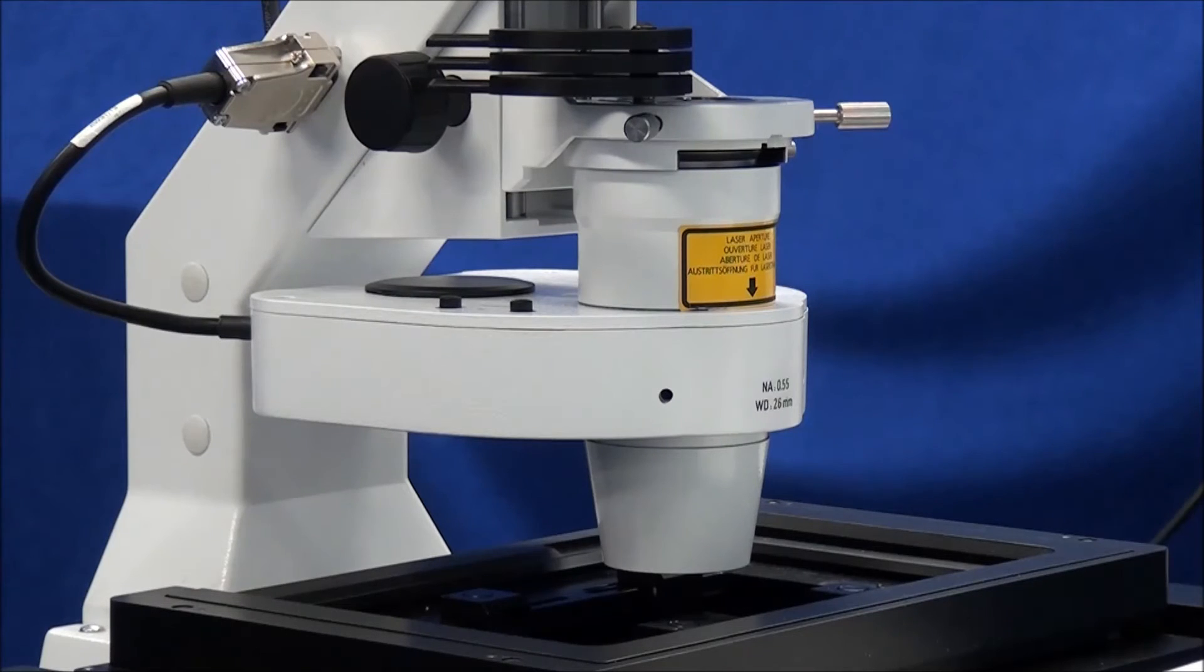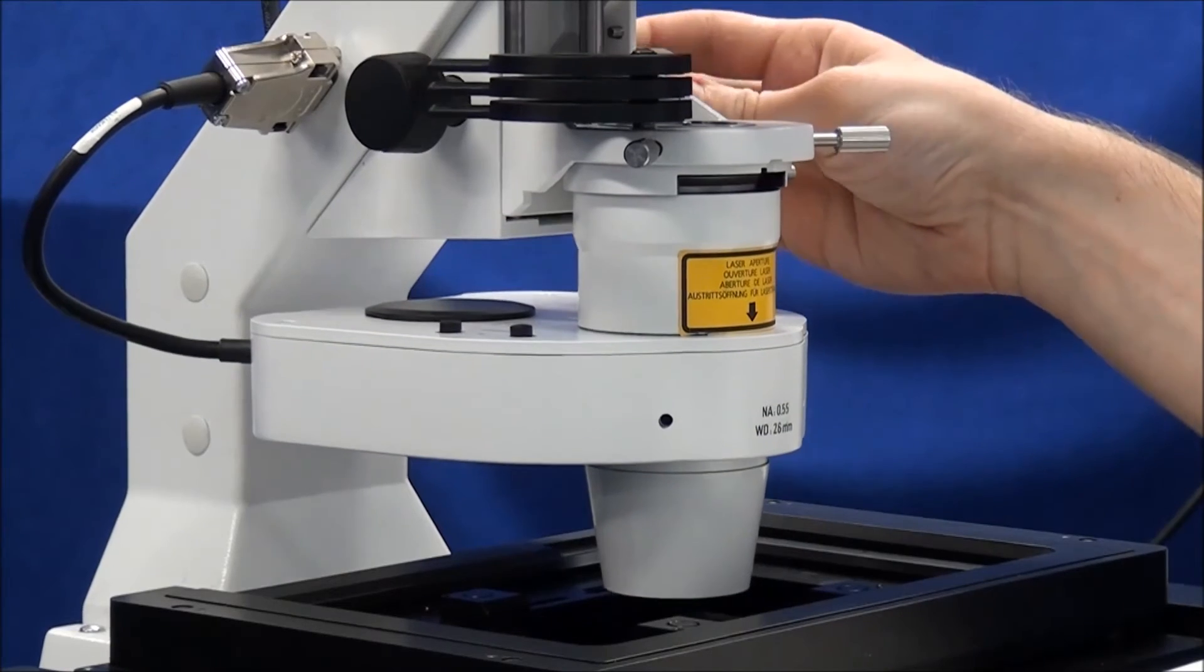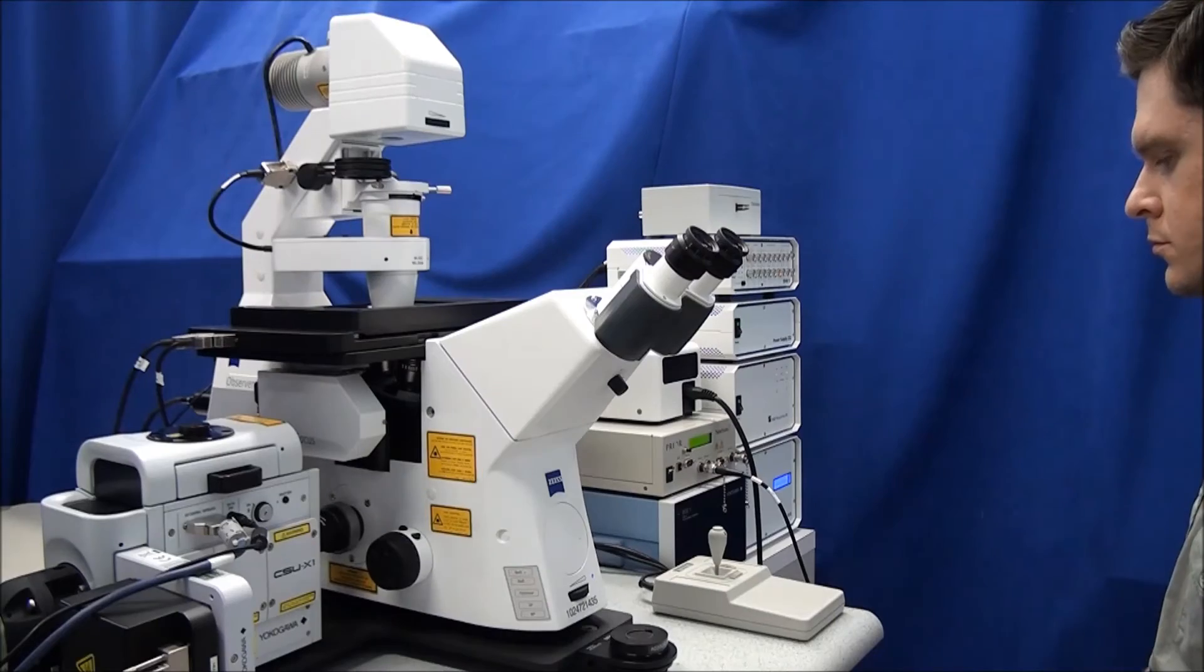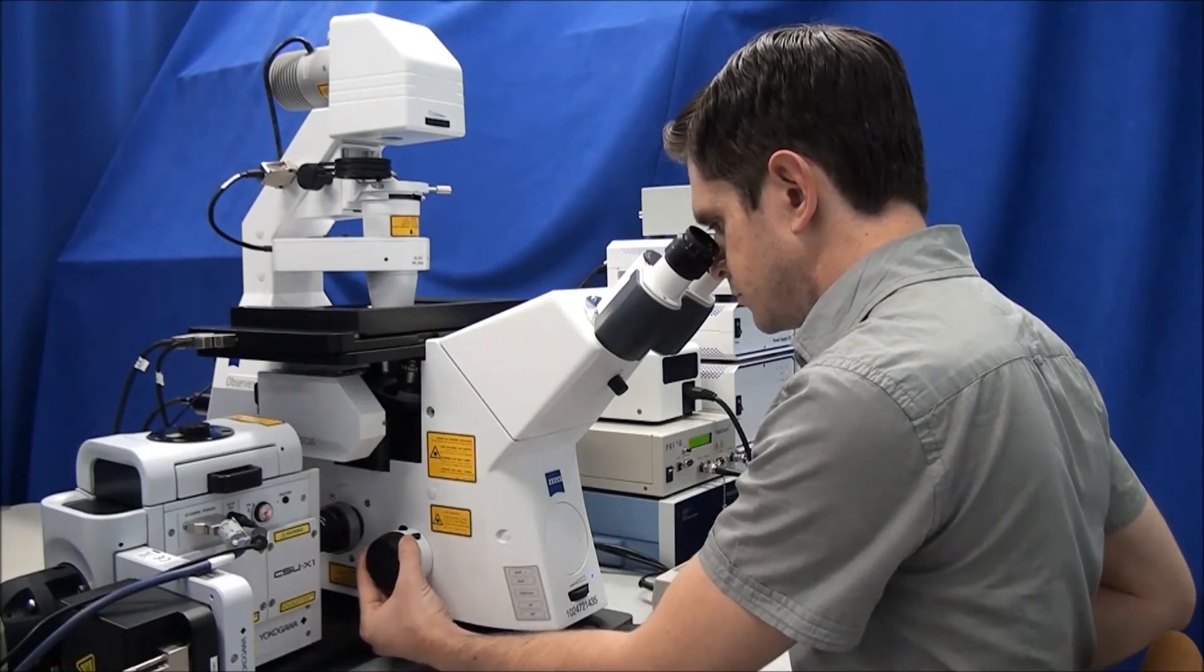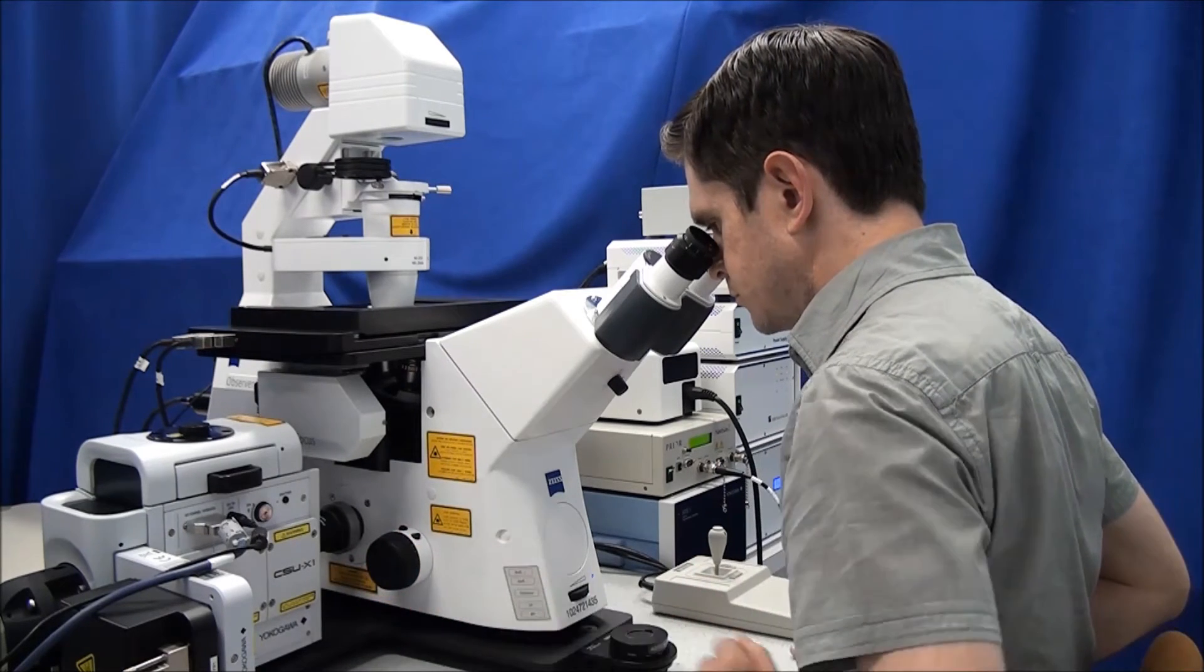Lower the condenser completely by rotating the condenser focus knobs. Look through the eyepieces. Focus on your specimen using the microscope focus knobs. Kohler alignment is based off of this objective focus. Make sure that your sample remains in focus for the rest of the alignment steps.